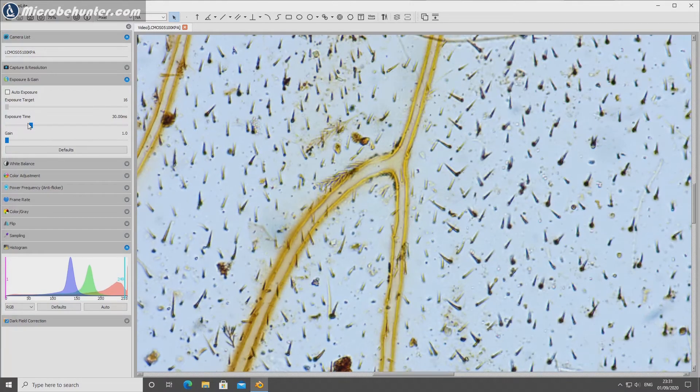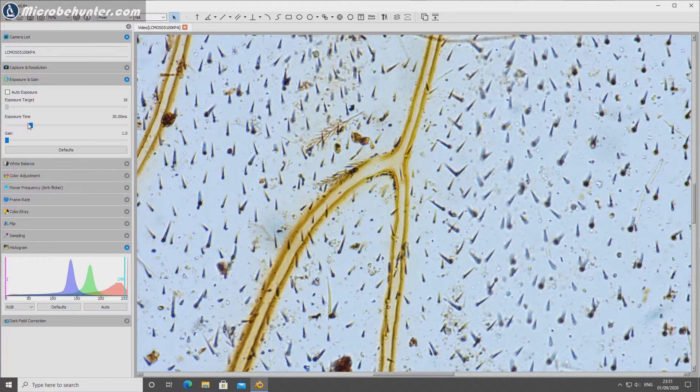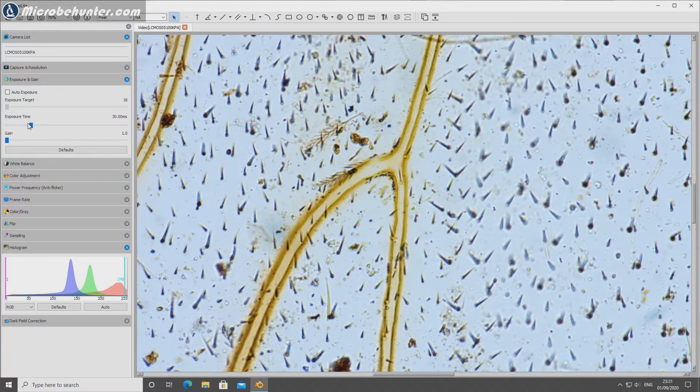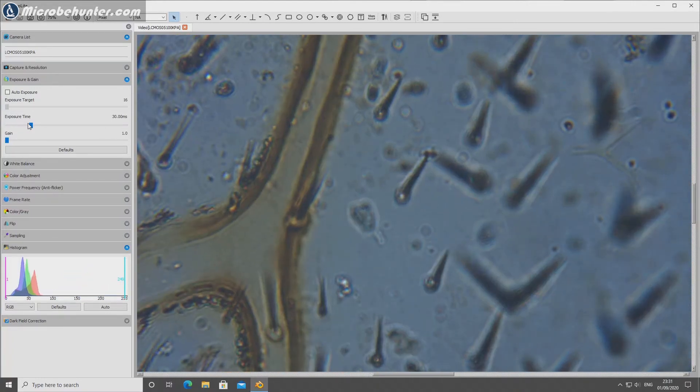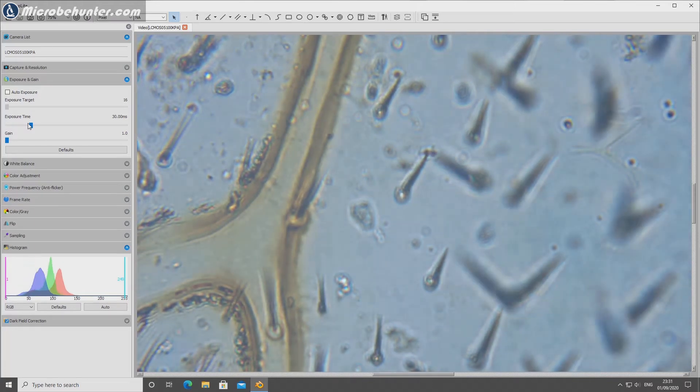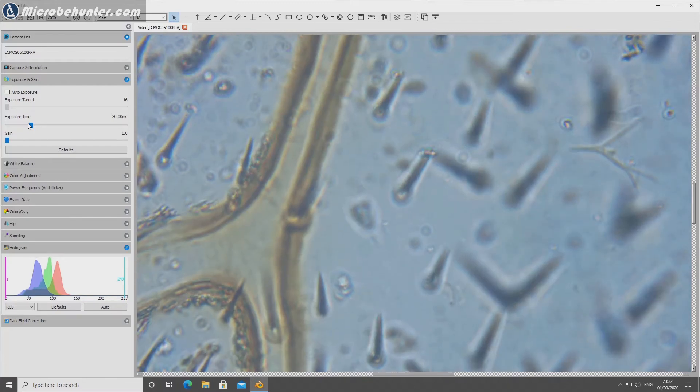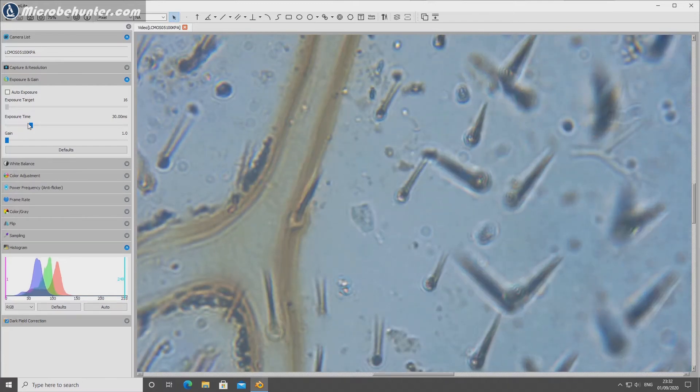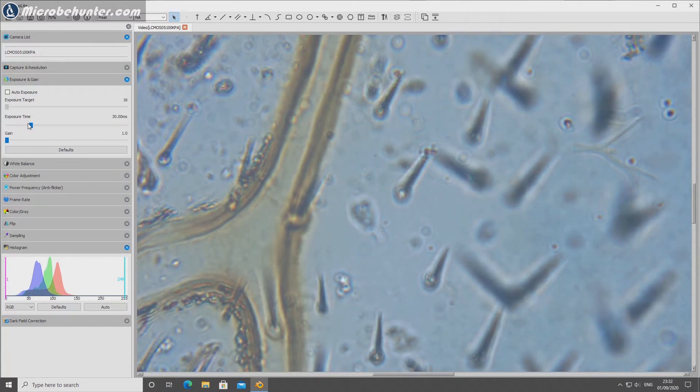This is now I'm using the 10x magnifying objective here. I'm going to switch to a yet higher magnification, this is the 40x and now we can see that the individual little hairs start to become significantly larger. Of course I focused back and forth as well and you can see it's possible even if there's no fine focus.